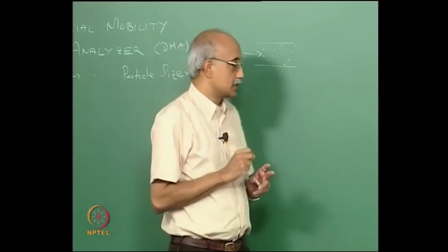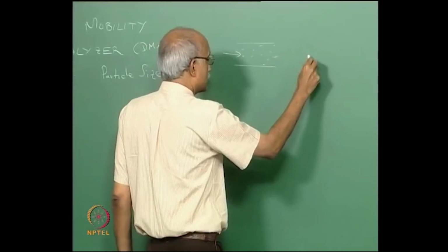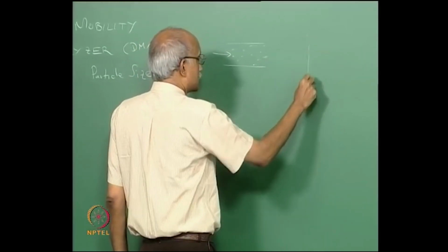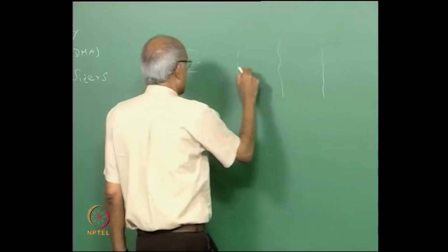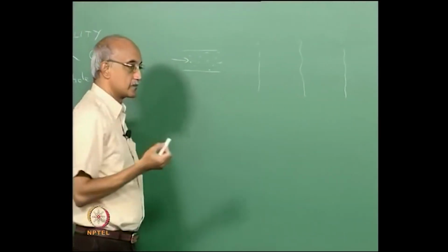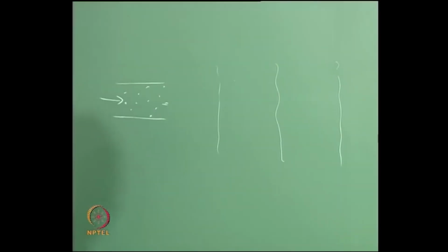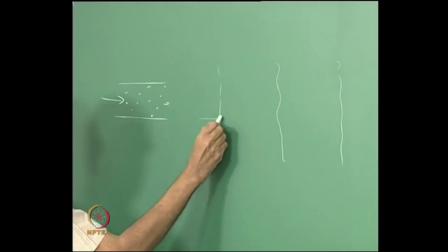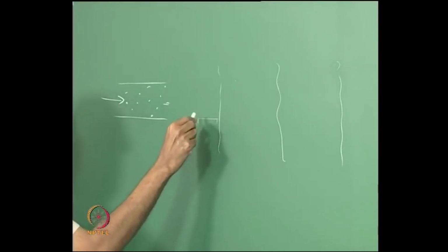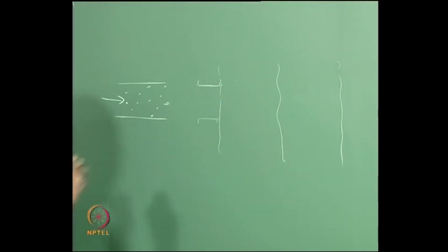And the reason for that is as the particles are going or flowing in this direction, you have various cells that are set up like this, and the capture screens are offset from the flow direction, and they are located in such a fashion that in order for the particles to get captured, they must actually diffuse to the screen.